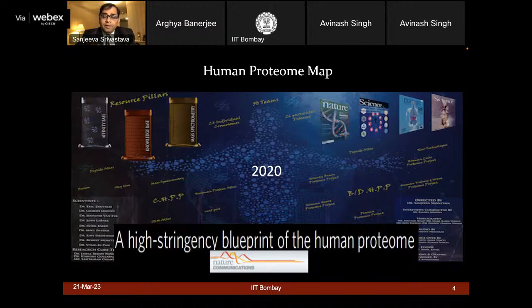And I think that's where the 1% FDR cutoff filter, looking at least two unique peptides of a given protein, the peptides being non-nested, and the length of peptides being 9 or so amino acids, were used to build this type of draft human proteome map.